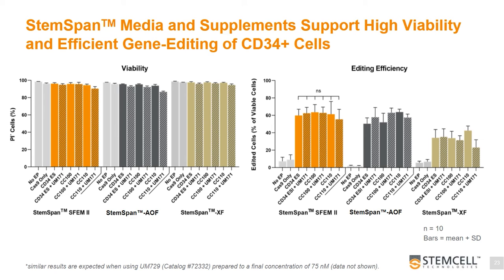Each medium type is grouped in its respective group and color, with SFEM2 shown in orange, AOF in gray, and XF in green. Supplements are shown on the graph in following order: CD34 expansion supplement first, CC100 second, and CC110 third. The addition of UM171 molecule to the respective cytokine supplement is indicated by striped bars.